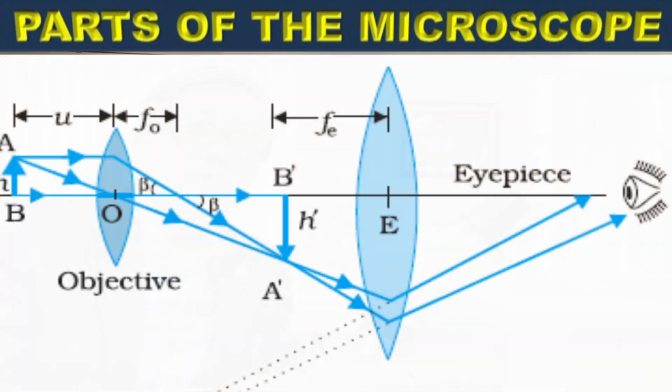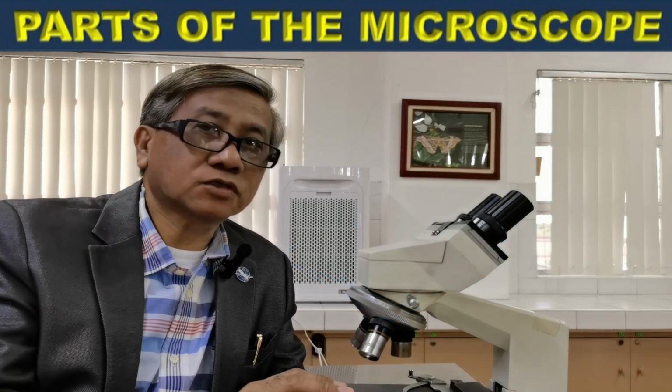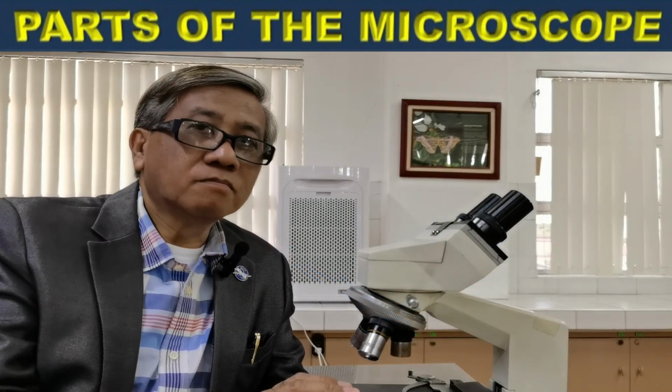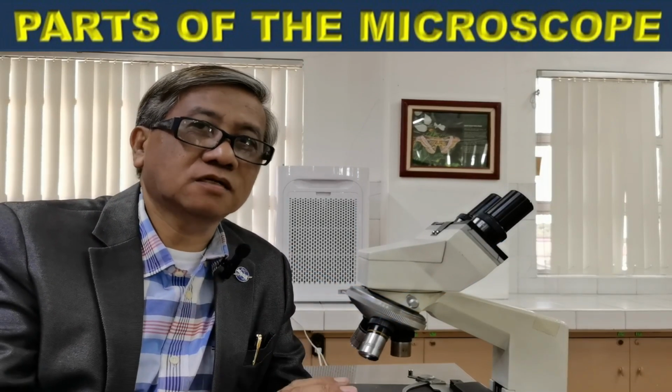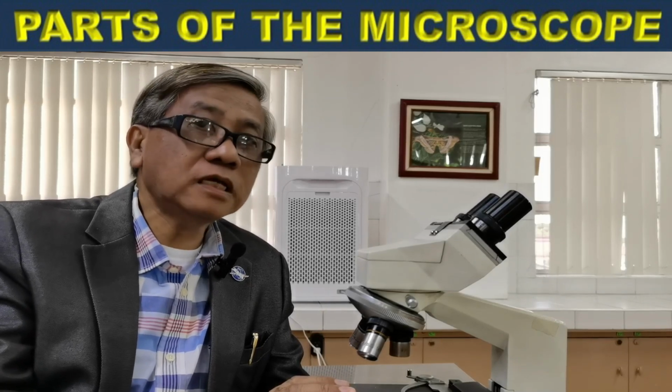The objective lens collects the light from the specimen and produces an initial image. Then that initial image is magnified by the eyepiece or the ocular lens. So that's how a microscope works. And the microscope was made by the Janssen brothers, Zacharias Janssen. Alright, so with that, let us now go into the details.